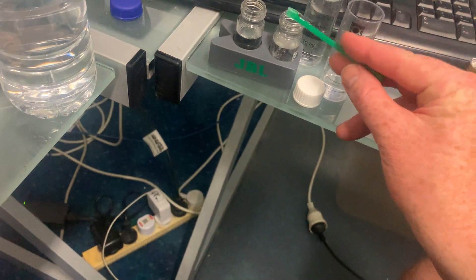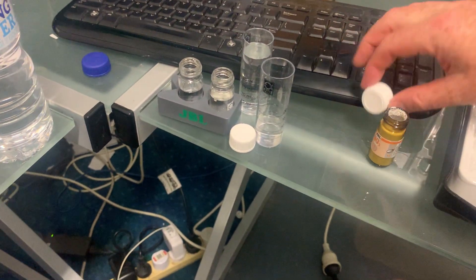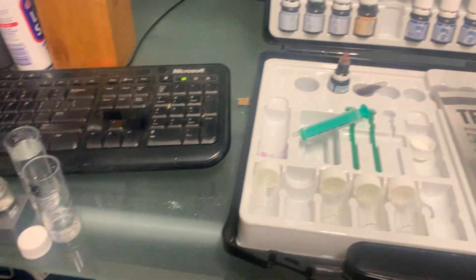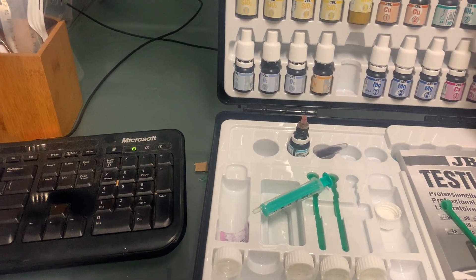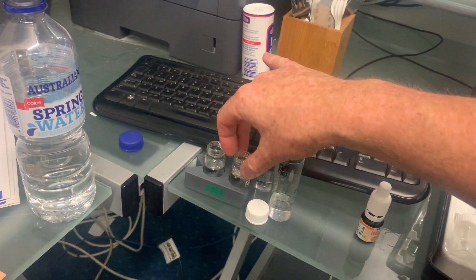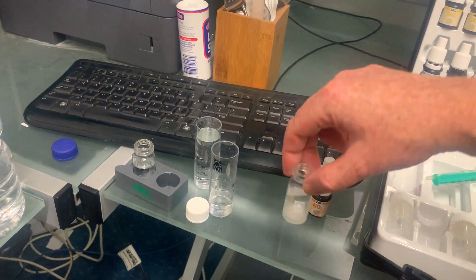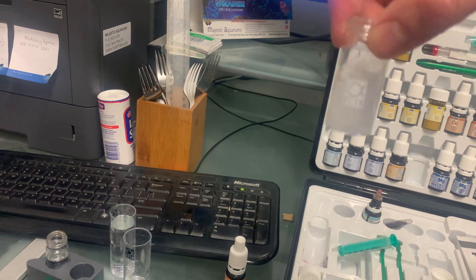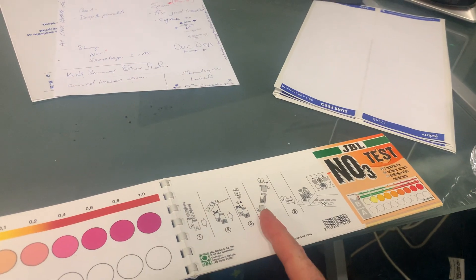Then you try to put your lids on — otherwise you'll spill it. Put that away, then get out number two. Give it a bit of a shaky shake — shaken not stirred — until it all mixes together. Then you're supposed to wait one minute.